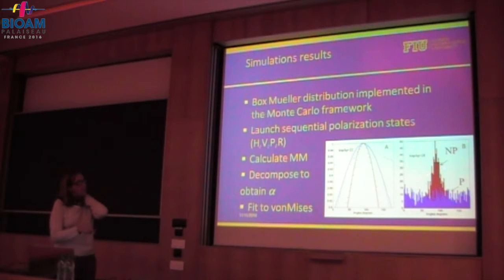But ultimately, the Monte Carlo results can clearly separate this pregnant versus non-pregnant data in the cervix, and we can even start quantifying it. And using those von Mises parameters, we're close. We're not exactly there because this was pretty different, but we are in the right ballpark.